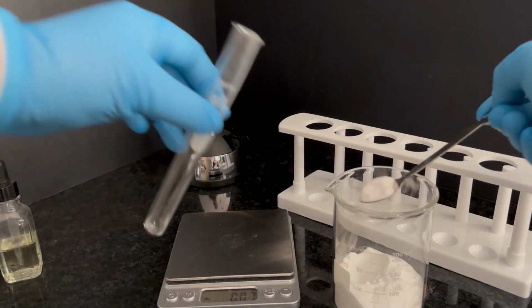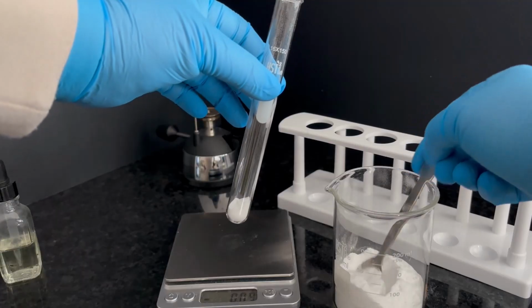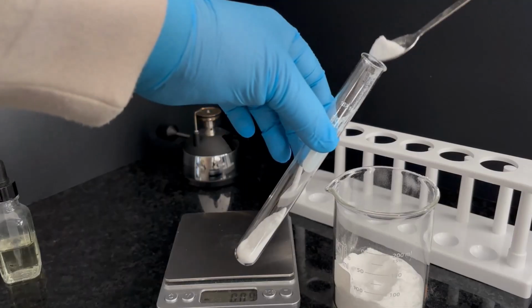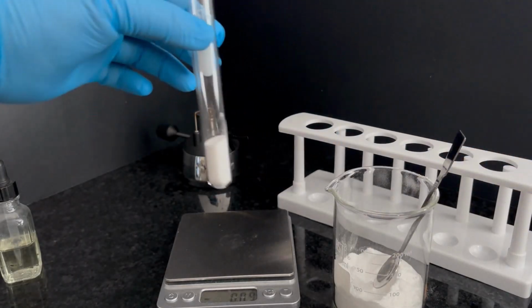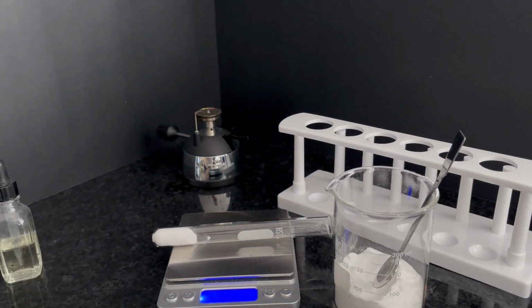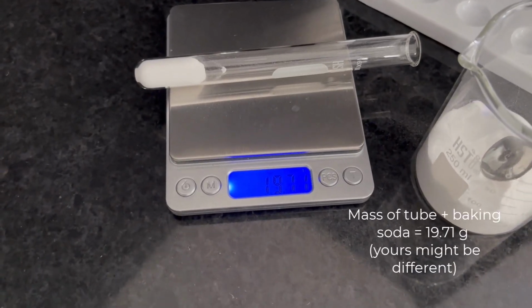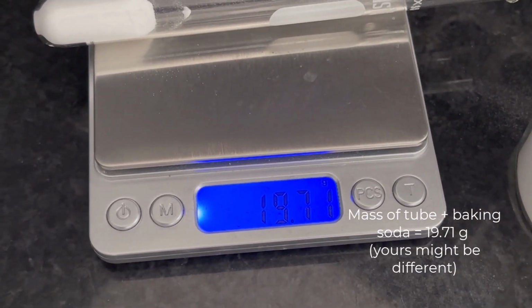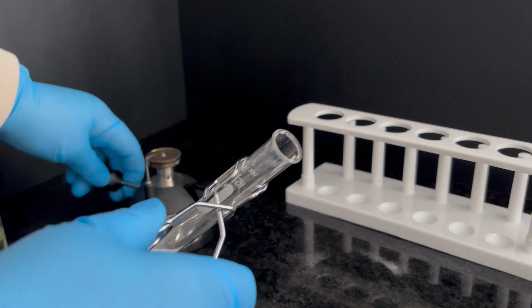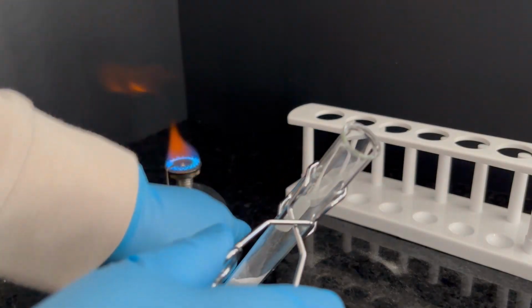Next, we'll add a few scoops of baking soda or sodium bicarbonate. And then take the mass of the baking soda and test tube. Then, we'll heat the test tube for 5 minutes.